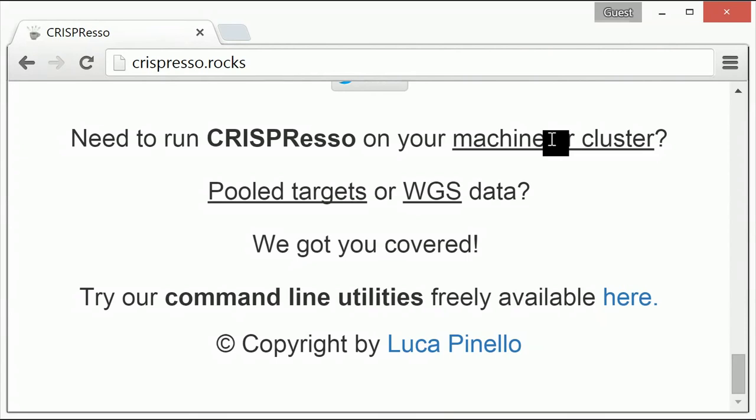Other command line utilities are also available for download that allow users to analyze data from pooled CRISPR experiments, or whole genome sequencing. These features are only available in command line versions.